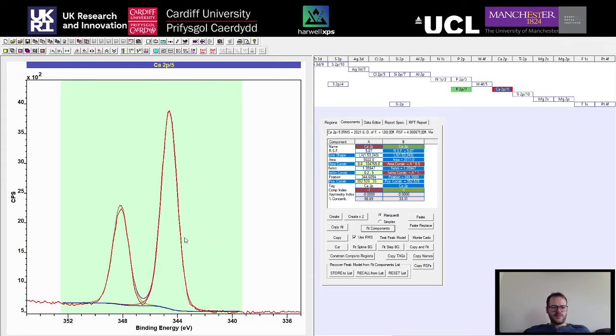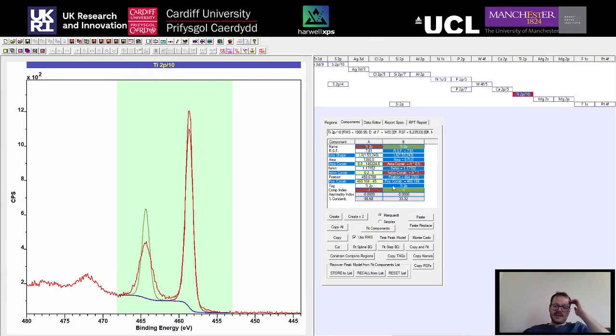It fits the data pretty much exactly. We've got that area ratio of 0.5 and the FWHM the same. But again, with titanium, because we don't have the same FWHMs, this default model doesn't fit. So if you use this function, you just need to remember to clear that constraint, and you can do that by coming down to the FWHM constraint and just typing in new limits. So say we just use the default 0.2 to 5. Click fit, and now that fits a lot better.